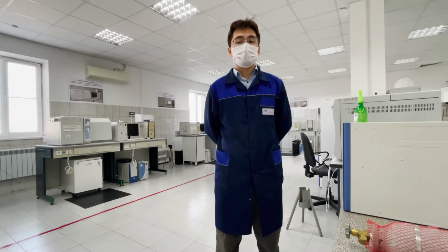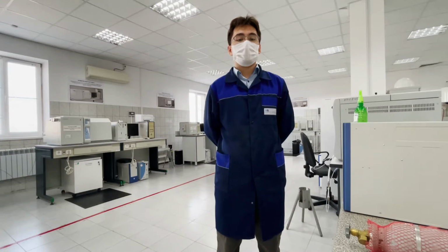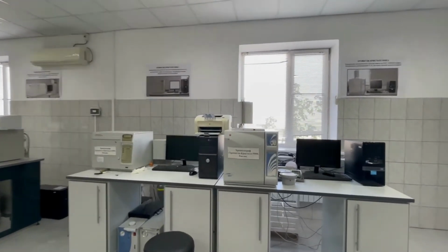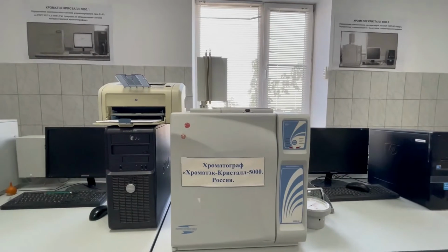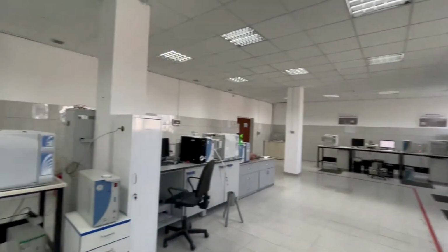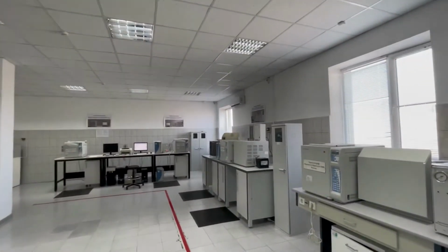The physicochemical characteristics of associated petroleum gas, the density, molecular weight of the gas, viscosity, heat of combustion, and the Wobbe number are determined. Mainly we've got gas analyzers, the Chromatec Crystal 5000, which are made in Russia. We have plenty of them for the different types and composition of the gases.